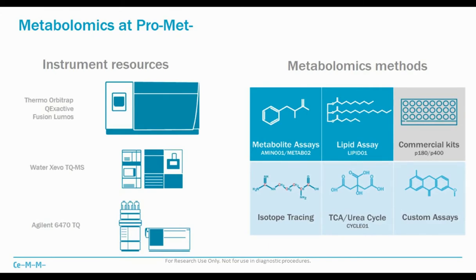This access to a wide range of mass spec instruments also gives us the opportunity to set up different workflows for metabolite analysis. We have workflows where we try to profile several hundreds of metabolites or lipids. We also have the capability to run commercial kits for metabolite analysis, and this includes the P180 kit from the company Biocrates.